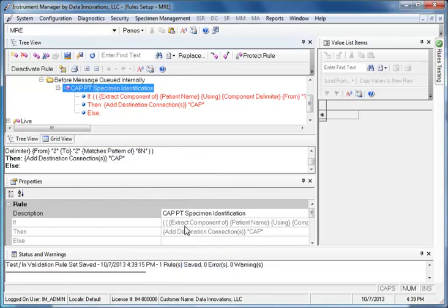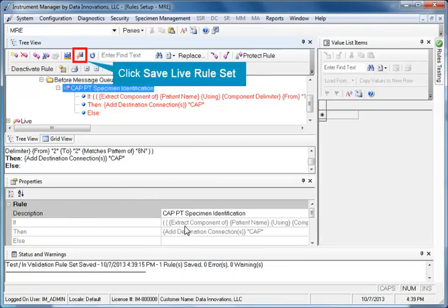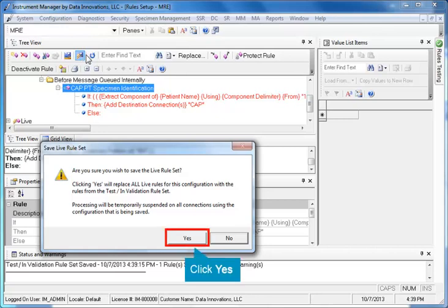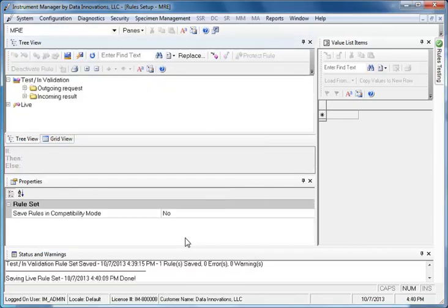The second step is to save a live rule set. Click the Save Live Rule Set button. A dialog appears asking if you are sure. Click Yes, and the rule is now live.